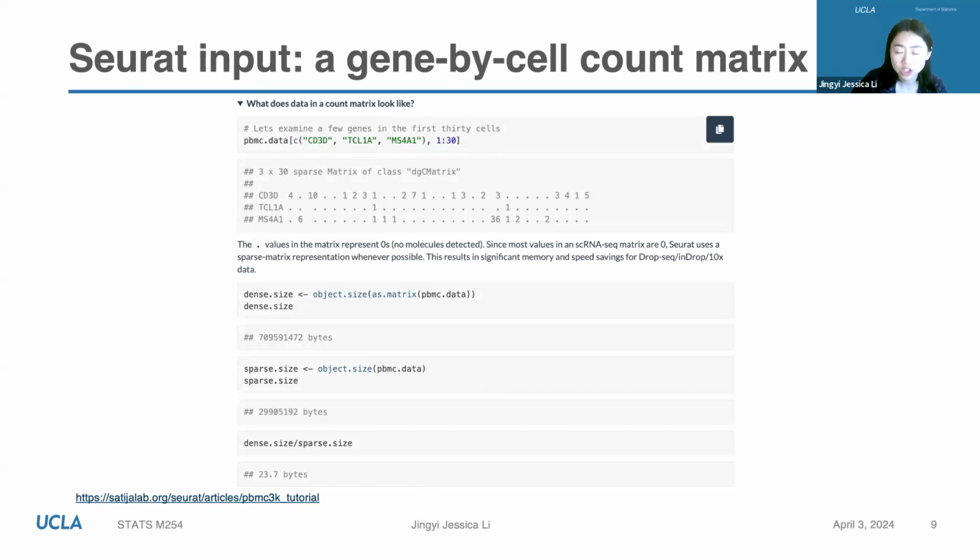The reason is that in a single cell RNA-seq experiment, we barcode the RNA from each cell, hopefully from each cell, in a droplet, because 10x is a droplet-based technology. In the droplet, a cell barcode is added, and then the barcode will be attached to the RNAs in the droplet.